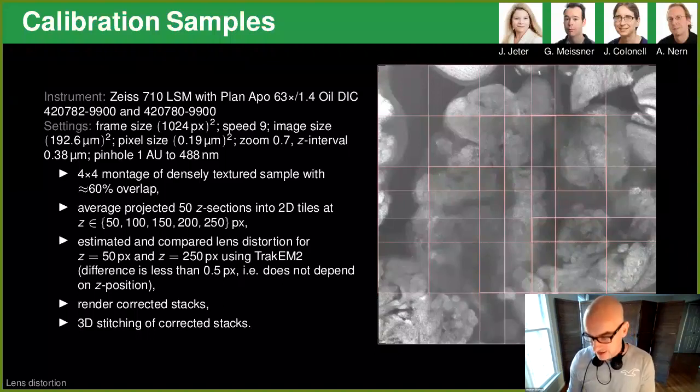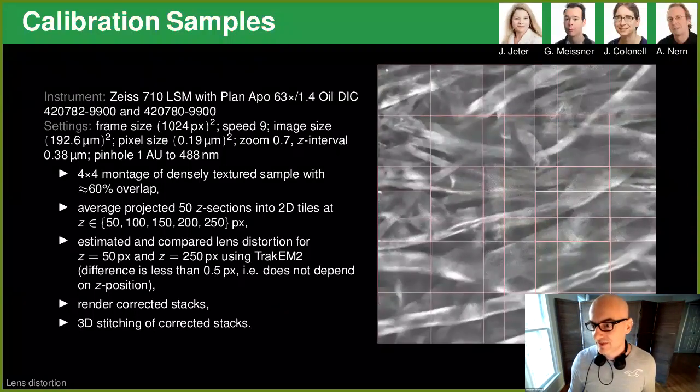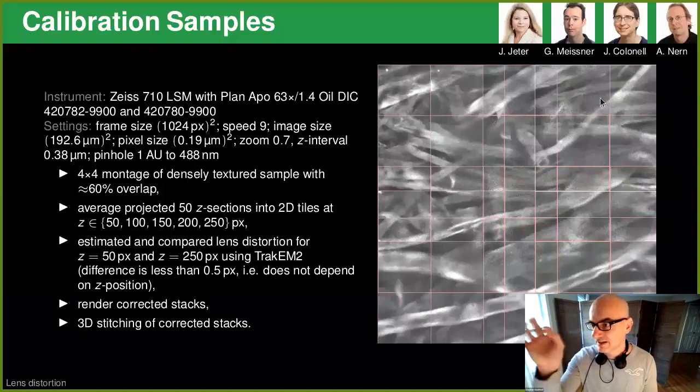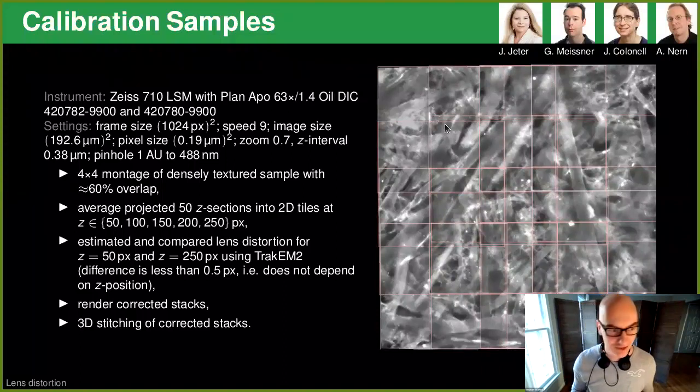And Jeffrey tried a bunch of things that he collected from the street. This is a paper sample. Unfortunately, the paper sample doesn't have good 2D features, so all these things are lines, so you can't find a lot of spot coordinates. That's not so great. Dirtier paper has a few more 2D coordinates to find, but it's still not very great.